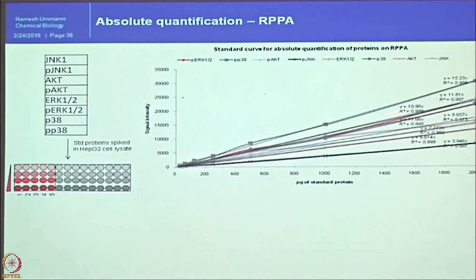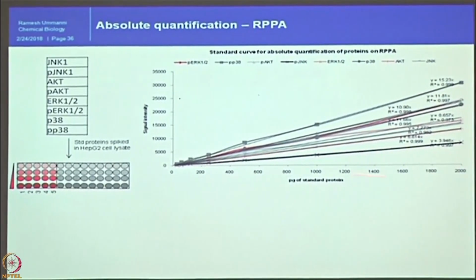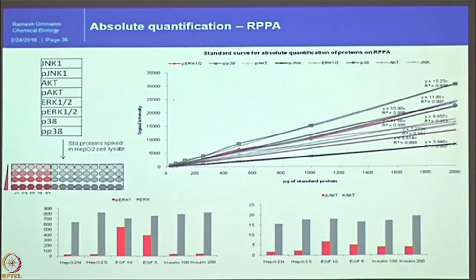We can show that for phosphorylated proteins and unphosphorylated protein detection, the linearity range is above 0.9, and then we looked at the signals detected here, in different cell lines and different stimulated samples. We can nicely detect total values like this, and upregulated and downregulated copies are mentioned here.